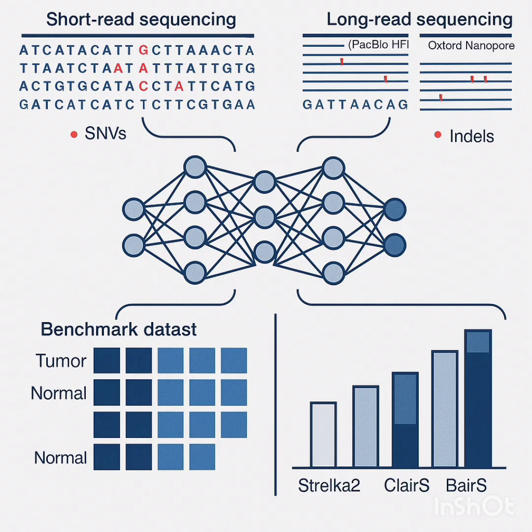Like a side-by-side comparison photo of the DNA at a specific spot. Exactly. The normal reads are visually stacked on top, and the tumor reads are right below them in this image. They feed this whole comparative image into a convolutional neural network, a CNN. Okay, a visual network. Right. So the CNN isn't just counting variants like older methods.